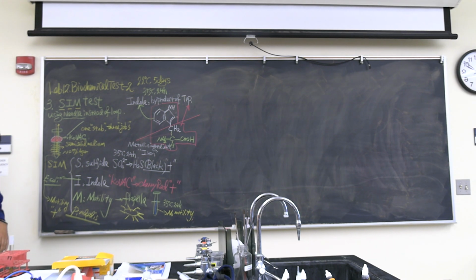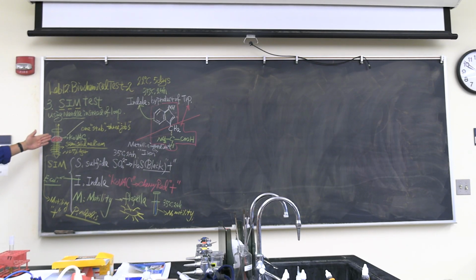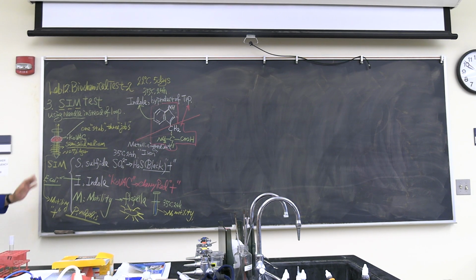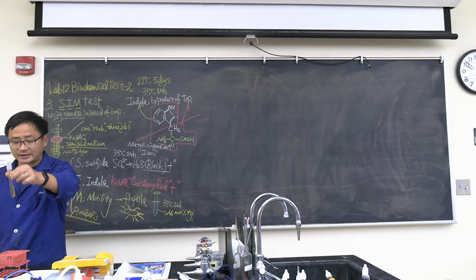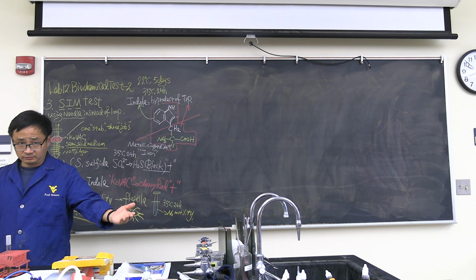And on Tuesday, we need first to look at motility. Now, by the way, this is the reason why we use semi-solid media to test the motility. If you see the bacteria right in the middle, no motility. If you see the bacteria goes everywhere, motility positive. Second, we're going to look at the color. If you see this turns black or even partially black, we say sulfide positive.